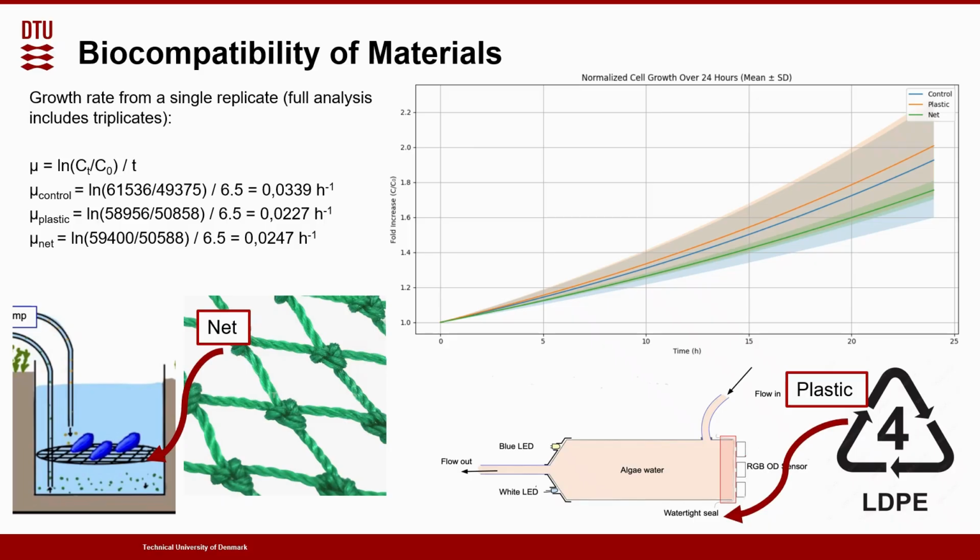Growth rates were calculated as the mean across replicates, with standard deviations included in the analysis. From the graph, we can see that all 3 conditions show similar growth, indicating that the materials are indeed biocompatible.